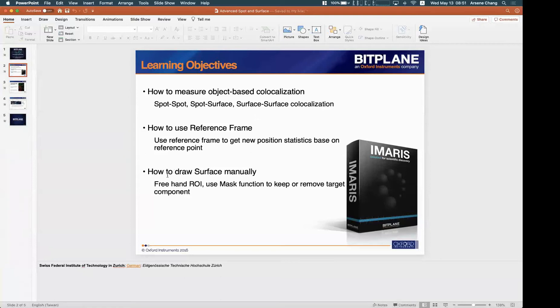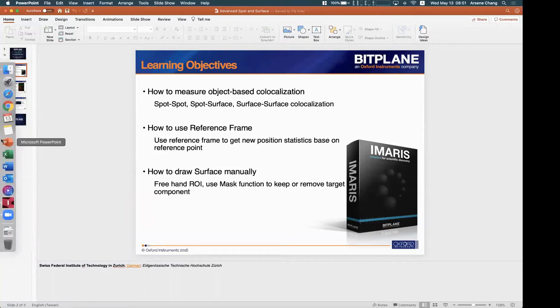The last one I want to introduce is how to draw a surface manually, basically to create a freehand region of interest or use the mask function to keep or remove the components.